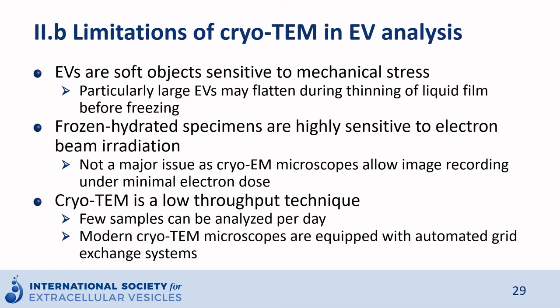What are the limitations of cryo-TEM in EV analysis? EVs are soft objects which are sensitive to mechanical stress, and therefore EVs may flatten down during the thinning of the liquid film just before freezing. This is more likely to affect the large EVs.